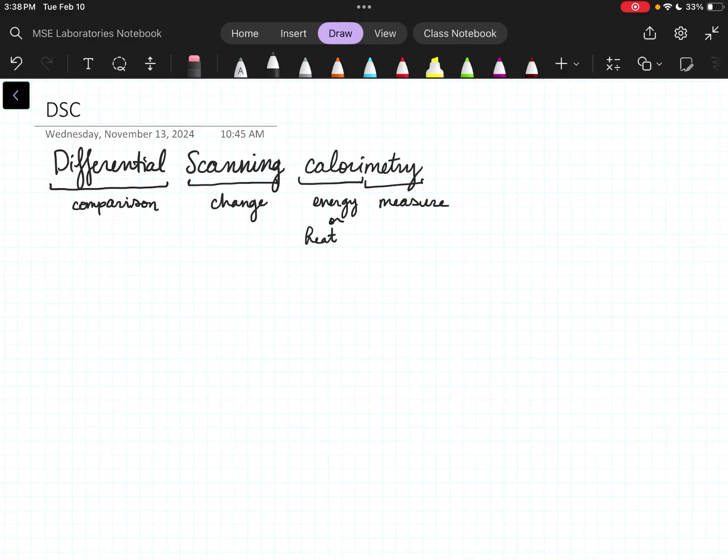So what we are measuring is how heat, and when I say the word heat, I am talking about an energy unit, affects temperature. Our bodies experience heat as temperature and temperature as heat.